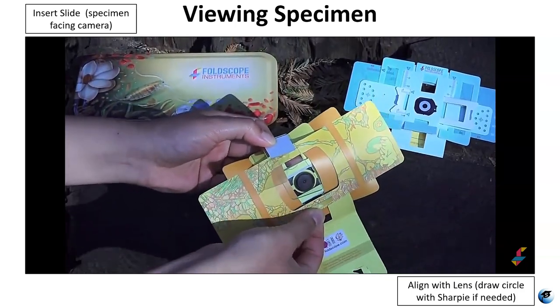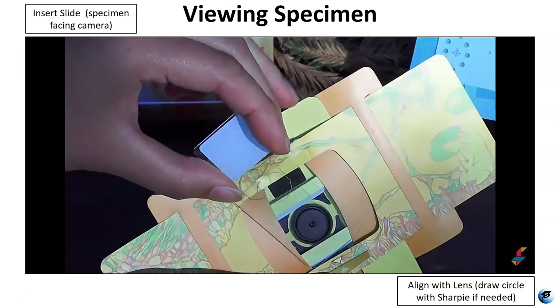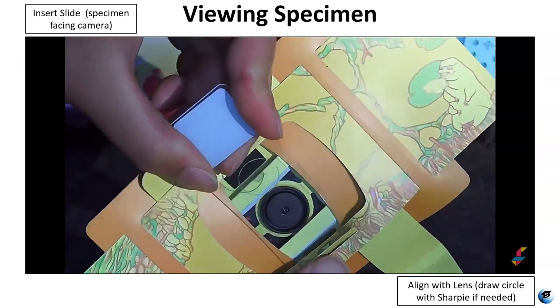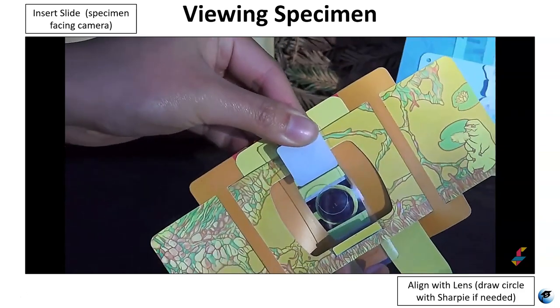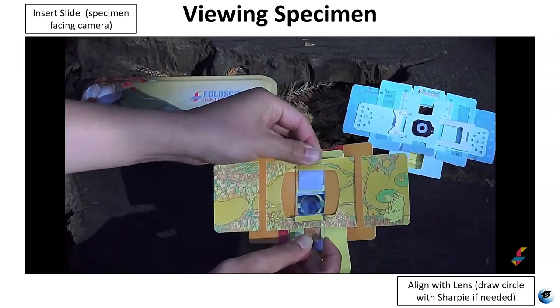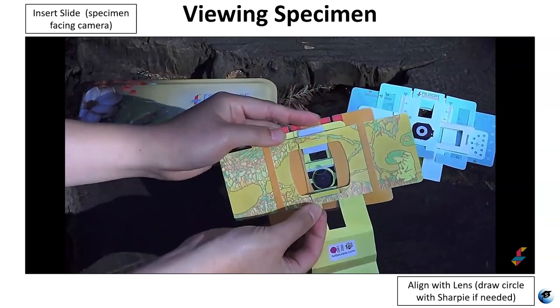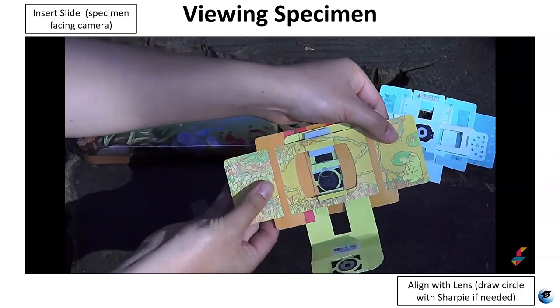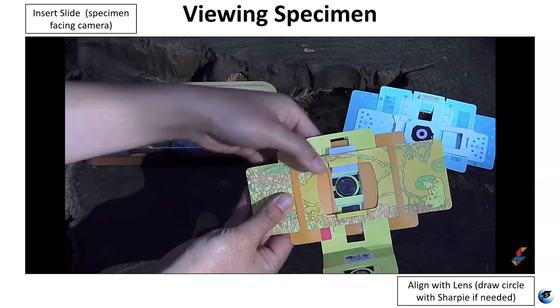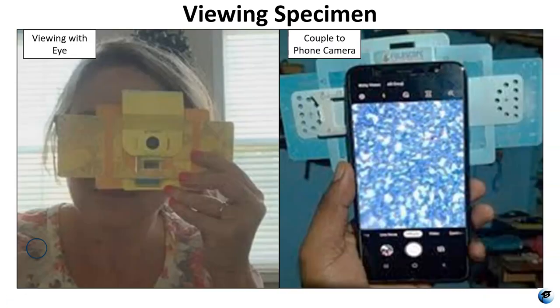Open up the little tabs — see the arrows? You're going to put the slide right in between those two arrows on each side, and then once you have the slide inside the tabs, move the slide so the specimen is going over top of the lens. There's a magnetic coupler that will couple to the lens. It may be helpful to draw a little circle around the specimen with a Sharpie in order to better align your specimen to the lens.